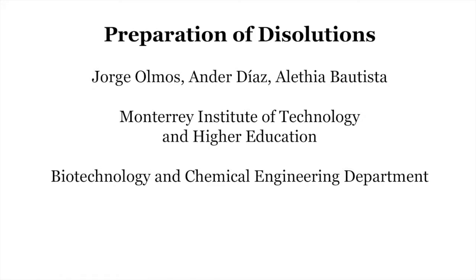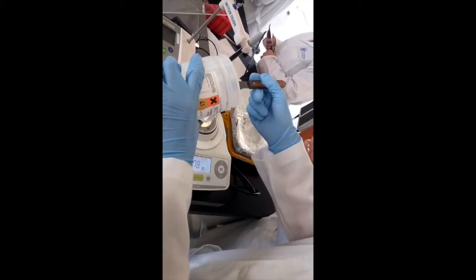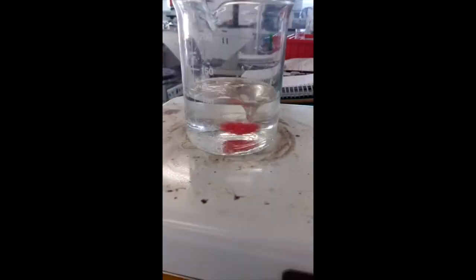In order to prepare any type of solution, we need to know first several factors and follow several steps. Most of the solutions are prepared in the following order. Select the solute, which must be soluble, weigh it using appropriate instruments and equipment, dissolve the solute, and finally prepare the final volume.